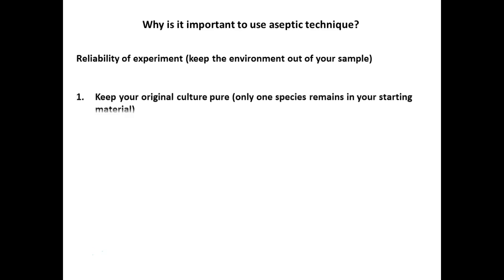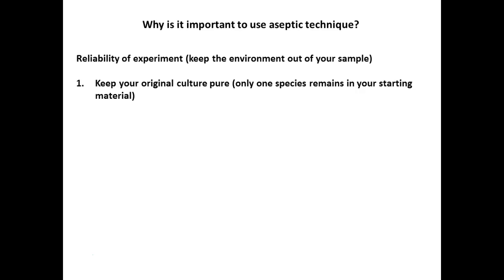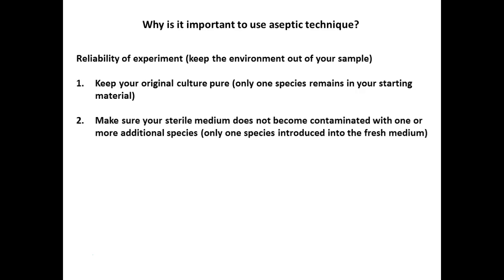So why is it important that we use proper aseptic technique? Right? Reliability of our experiment, right? Keep the environment out. We want to keep it pure. We want to make sure it's just that one organism we're studying. And we also don't want the media to become contaminated with additional species.